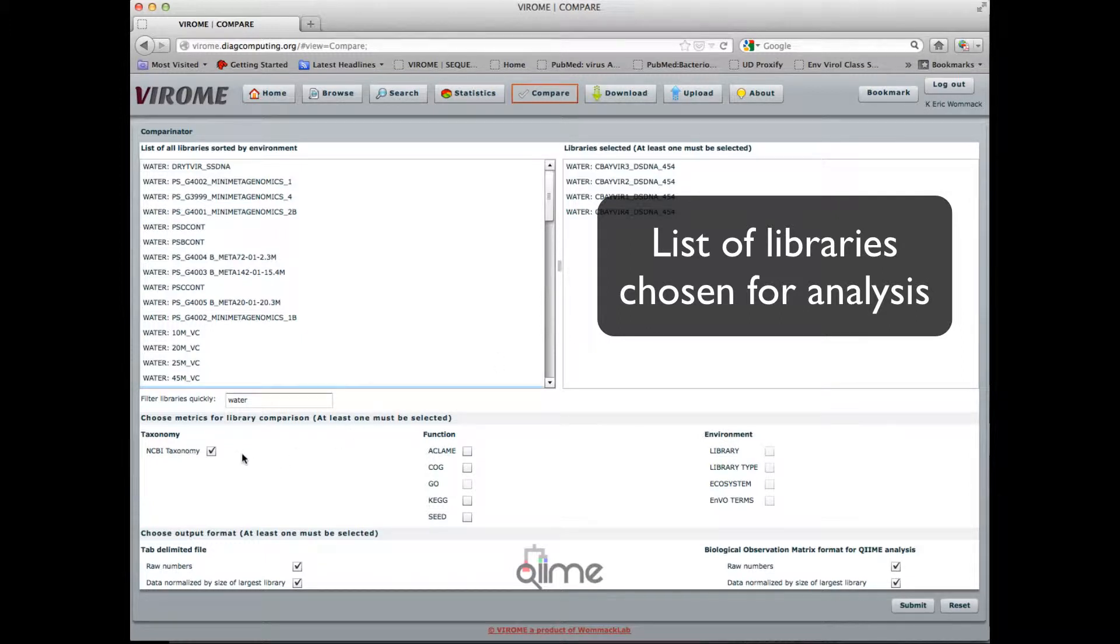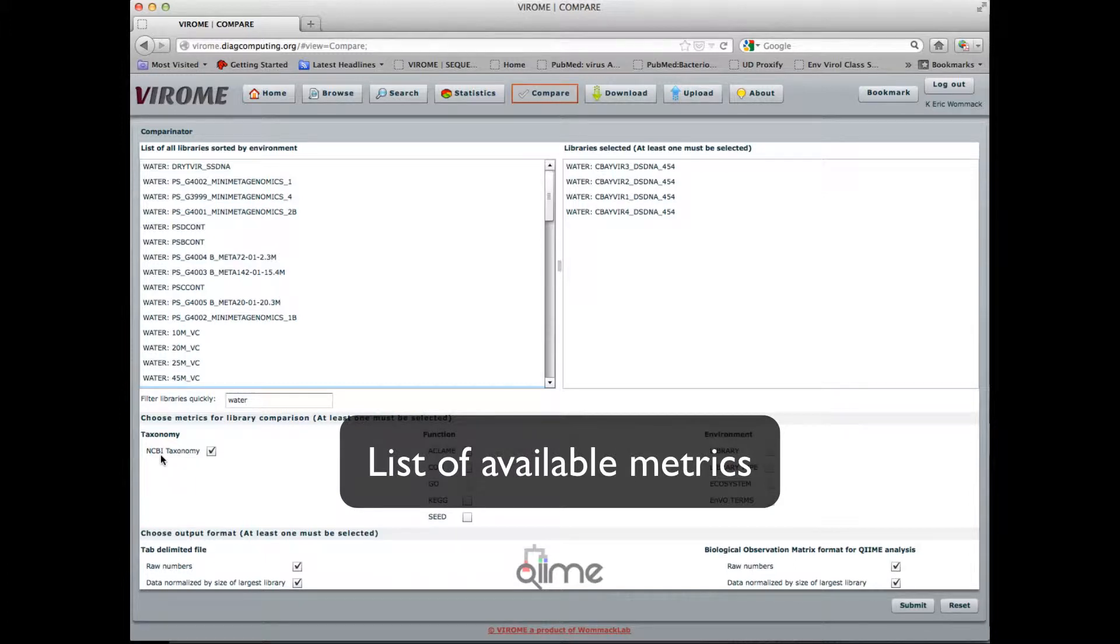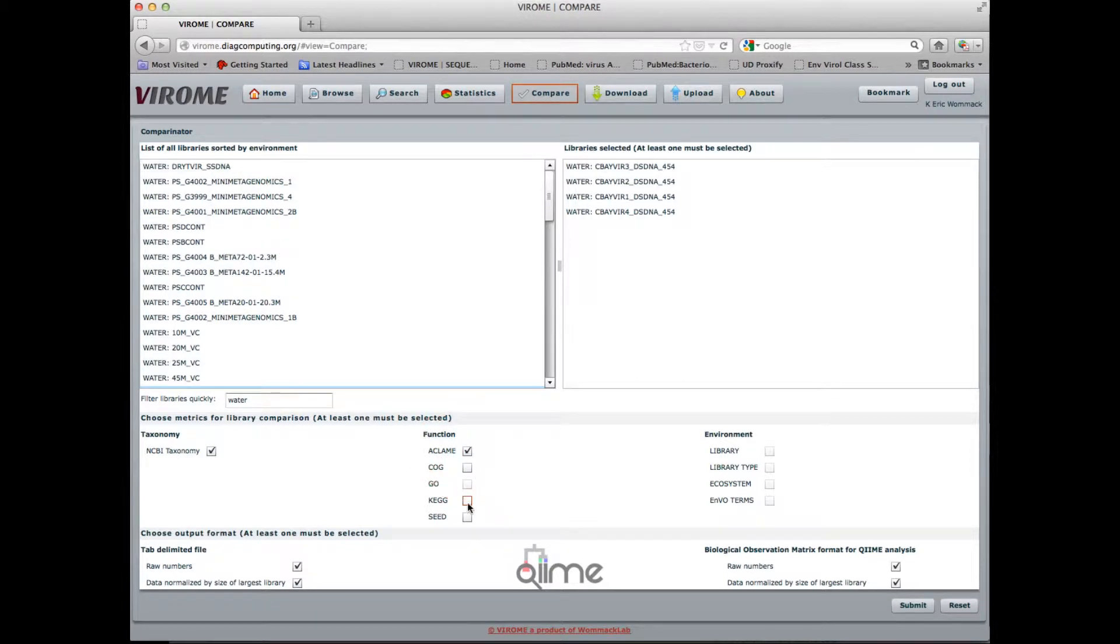Down here we can choose which metrics we want to use for comparison. This would be the taxonomic distribution of hits to the ORFs. Here would be functional classification, so ACLAME, KEGG, and SEED.